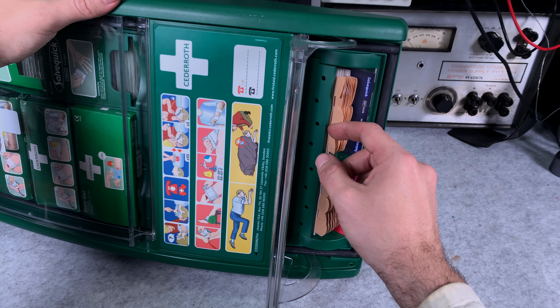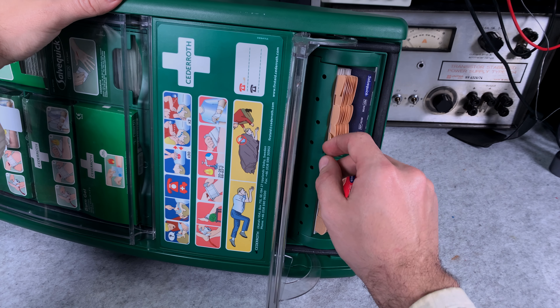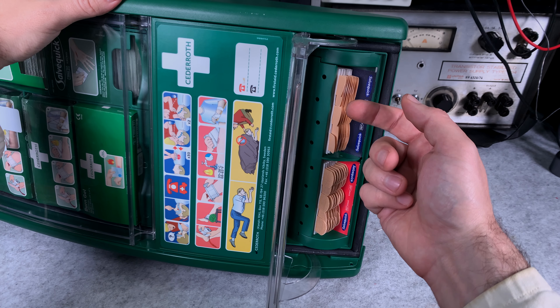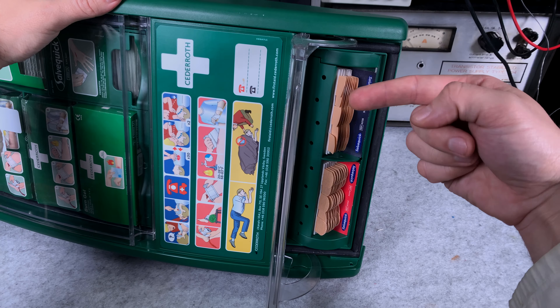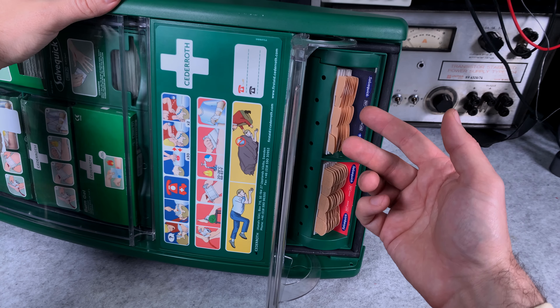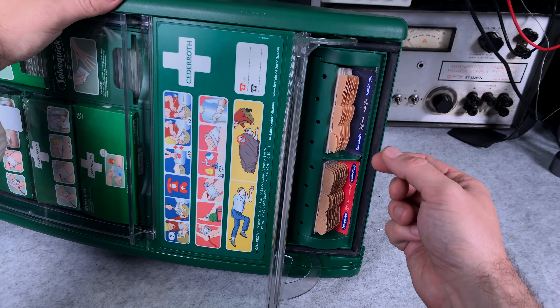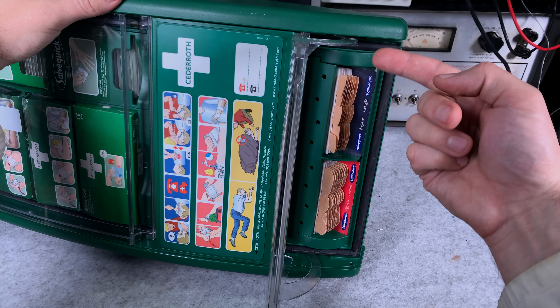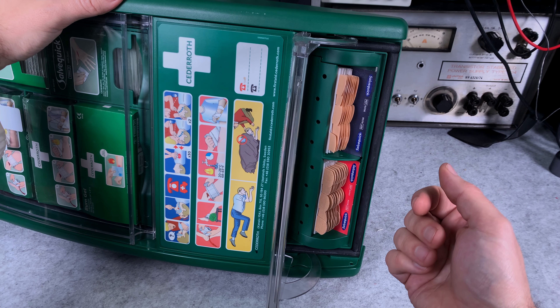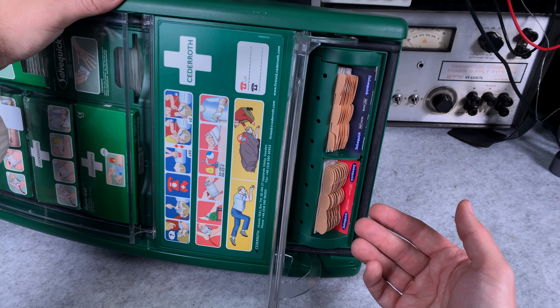That part is protected; you grab it, you pull it, and after you do so one side is being peeled off. That's extremely important because it prevents people from taking them home — you grab just one and it's going to be peeled off on one end, so you basically do not have the opportunity to steal it; you are just going to use as many as you need.